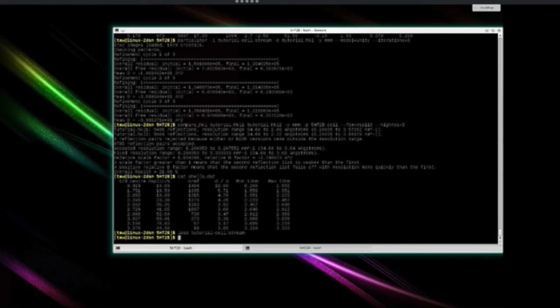The general idea of post-refinement of partialities, of course, is nothing new. It's been around since long before I was even born. Already in those papers, they commented that the procedure is highly convergent and you don't need more, certainly no more than 3 iterations.